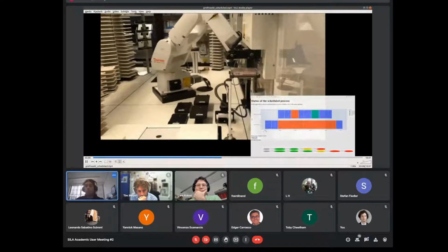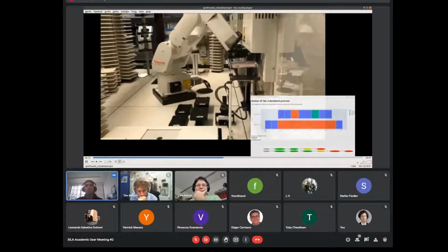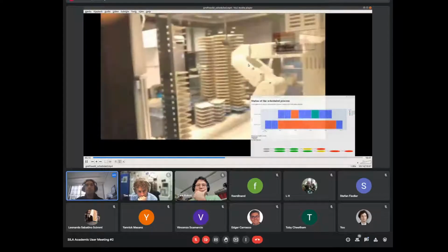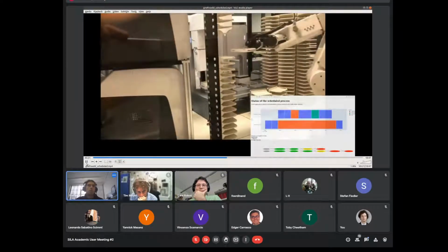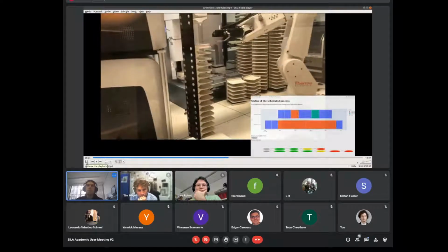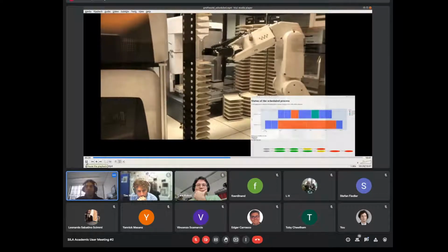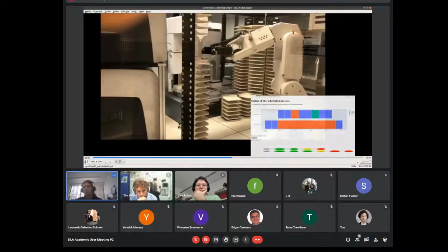Currently you see a lid on this plate. This has to be removed for the absorbance measurement. Now you will see it takes off the lid and does some shaking, because in the past the plate got stuck to the lid when there was some glucose solution.